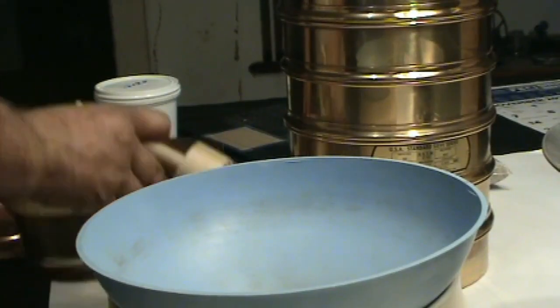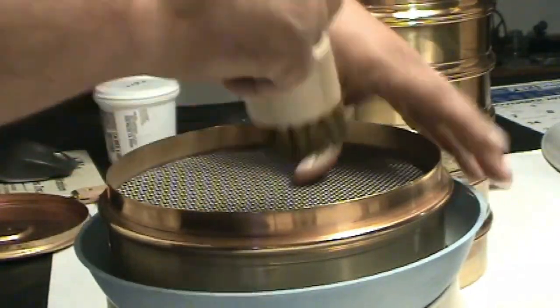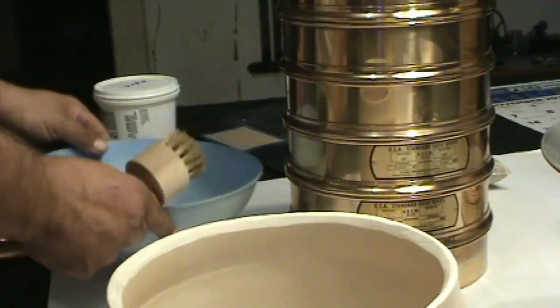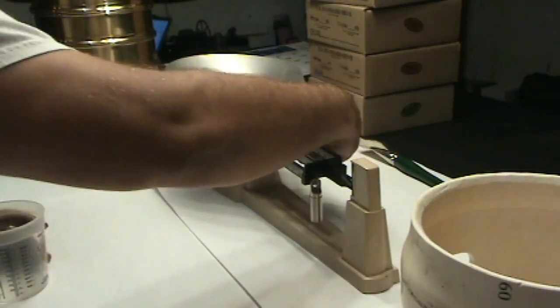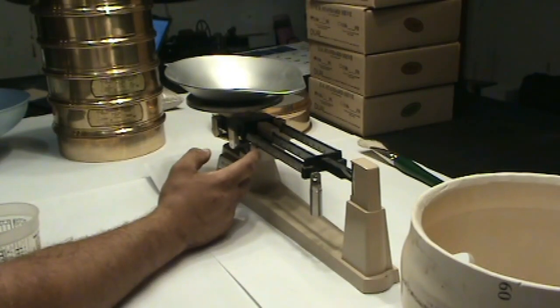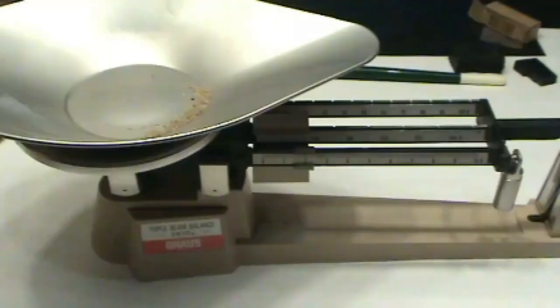Sand designated as 1220 is generally graded so that nearly 100% passes a number 12 sieve, with close to 0% passing a number 20 sieve. For our applications, we insist these margins be no greater than 5%. Consistency is important. We prefer for the greatest percentage of sand to be grouped in the middle of the mesh ranges. Sand retained by the number 12 sieve weighs 1.9 grams, which is 0.58% of the total.